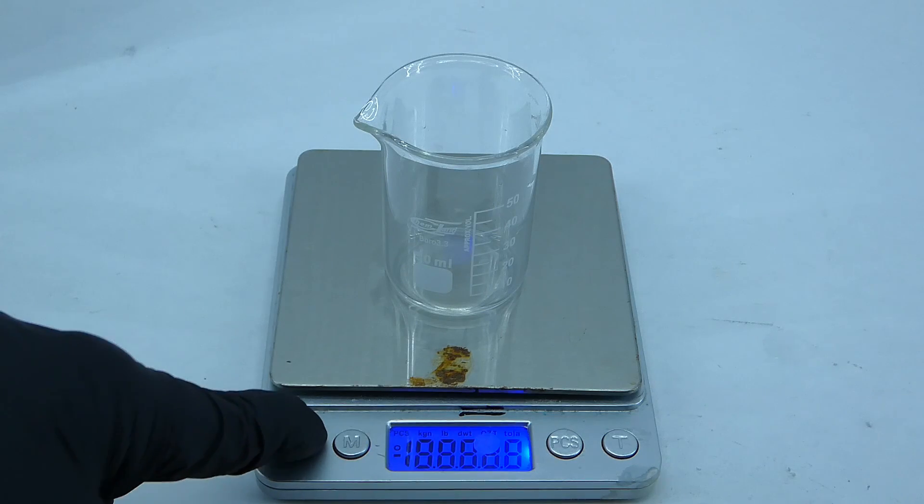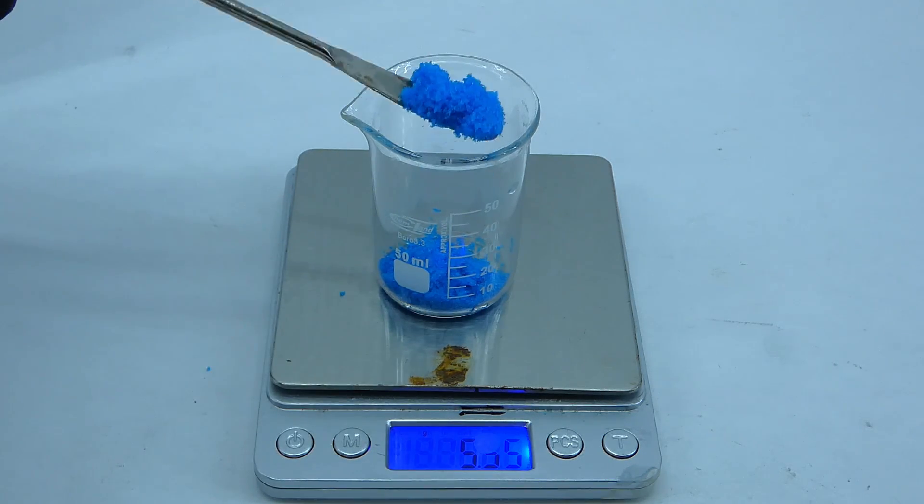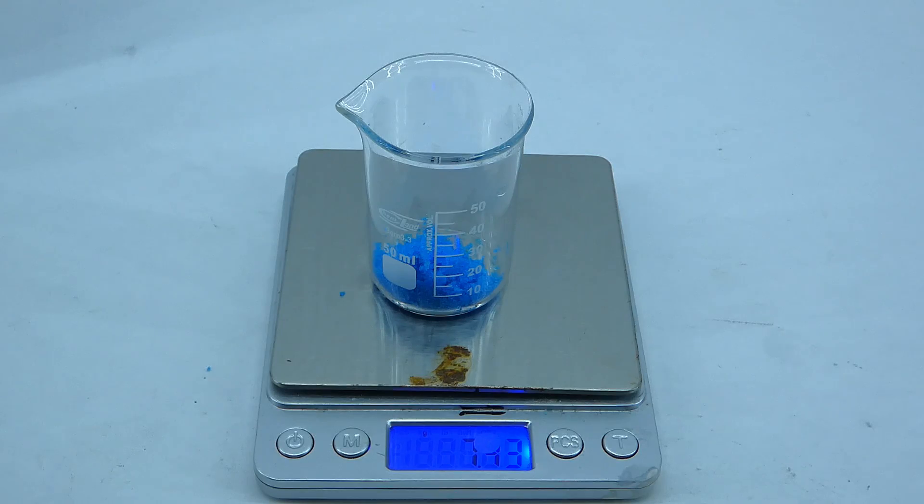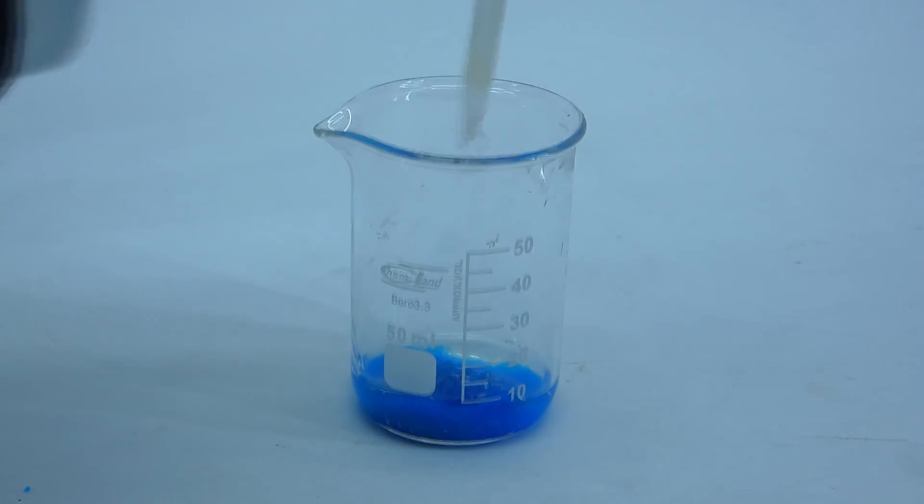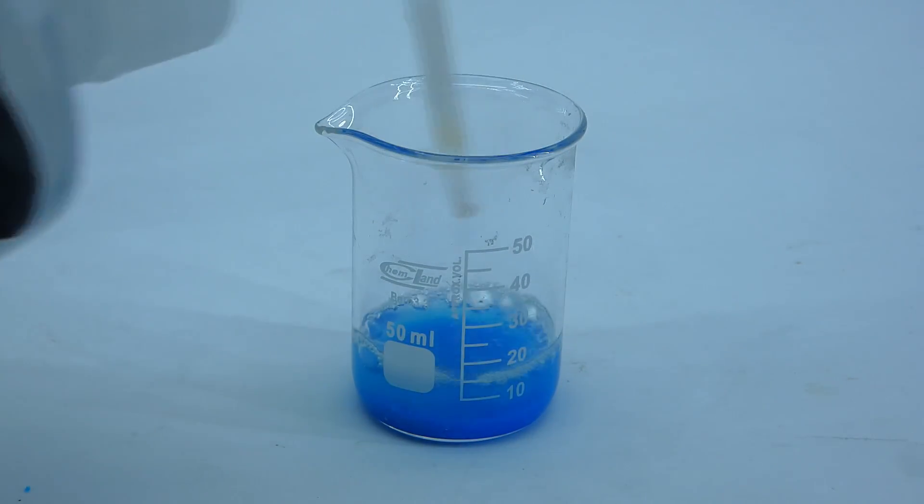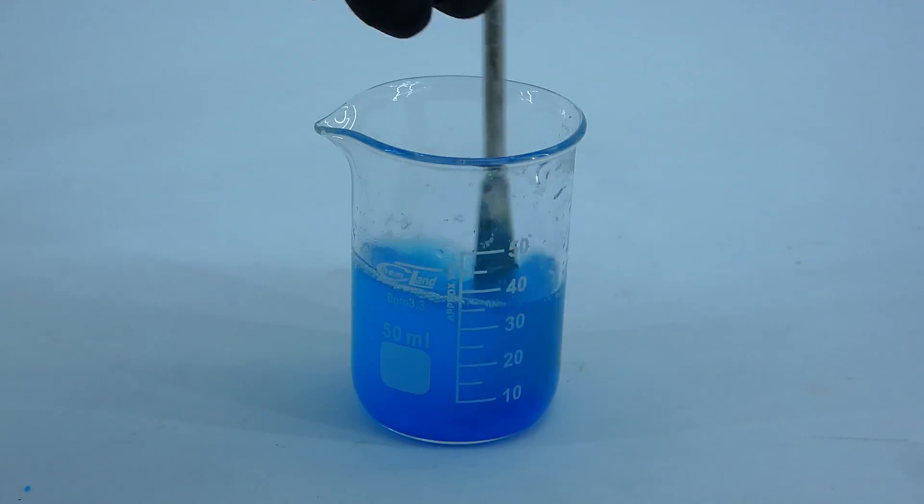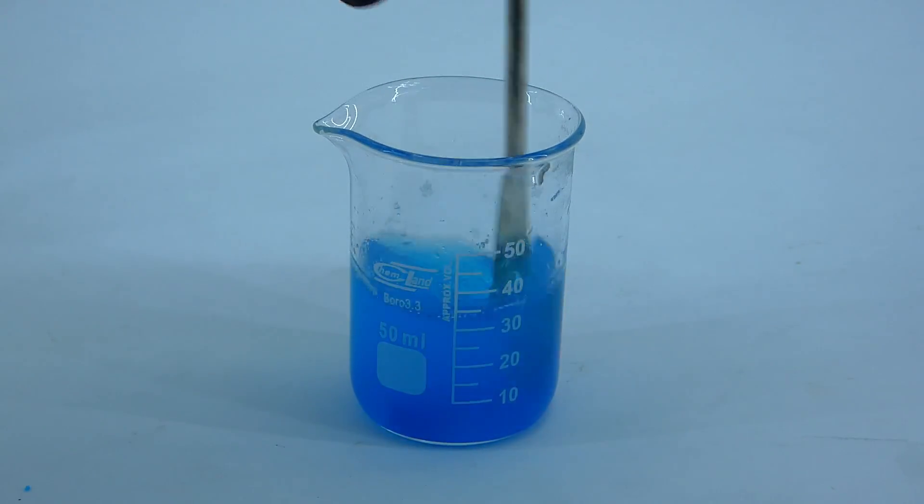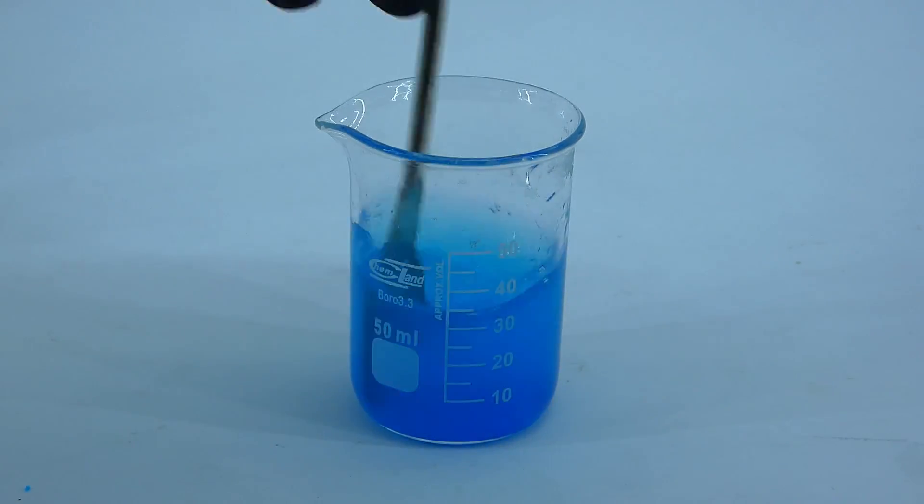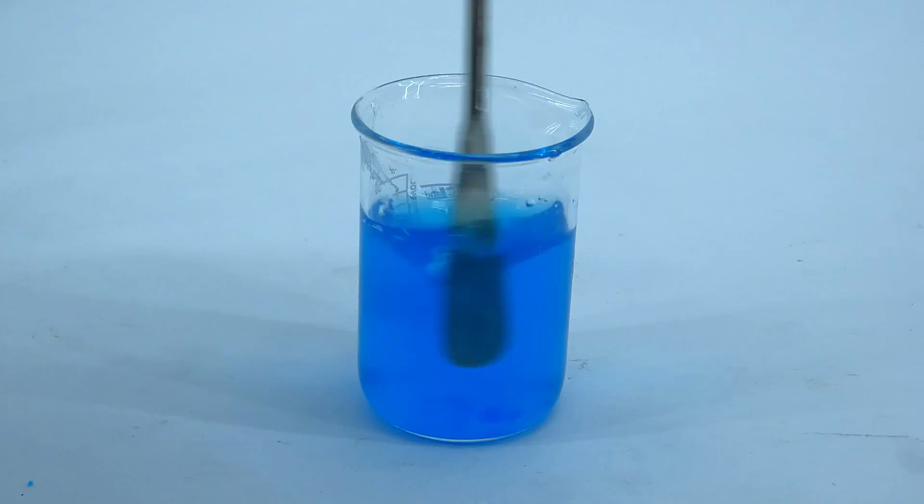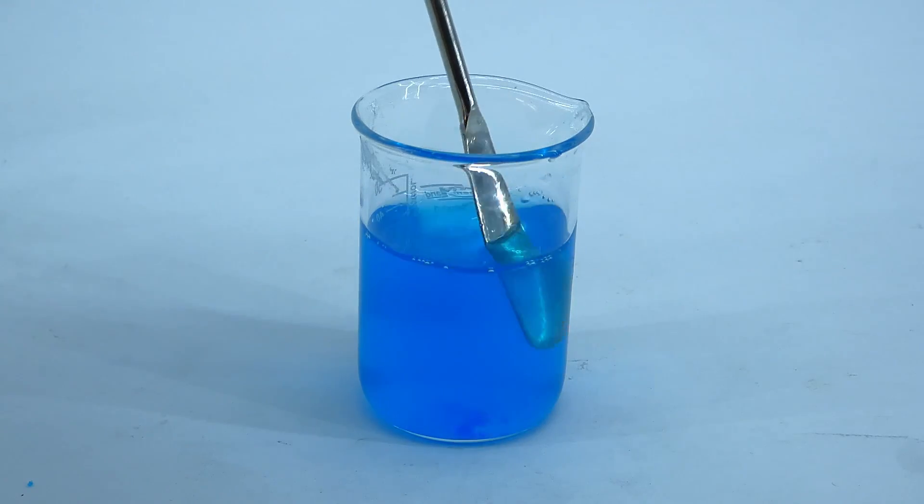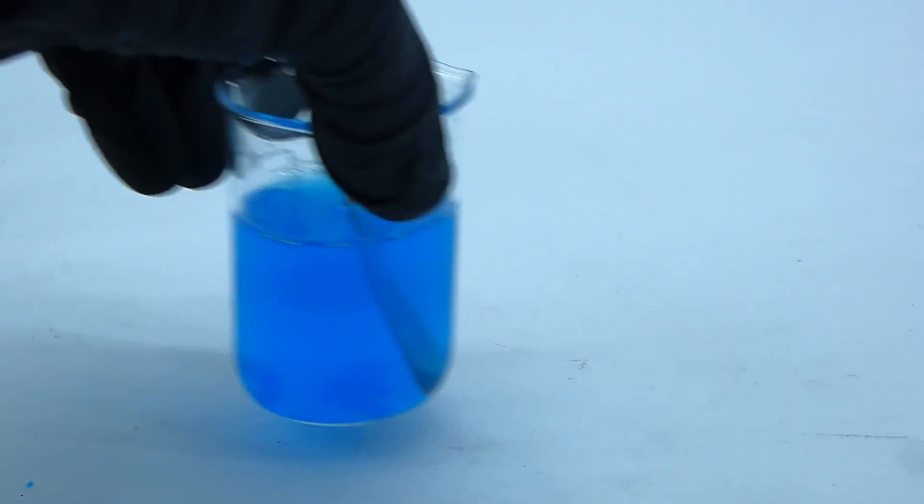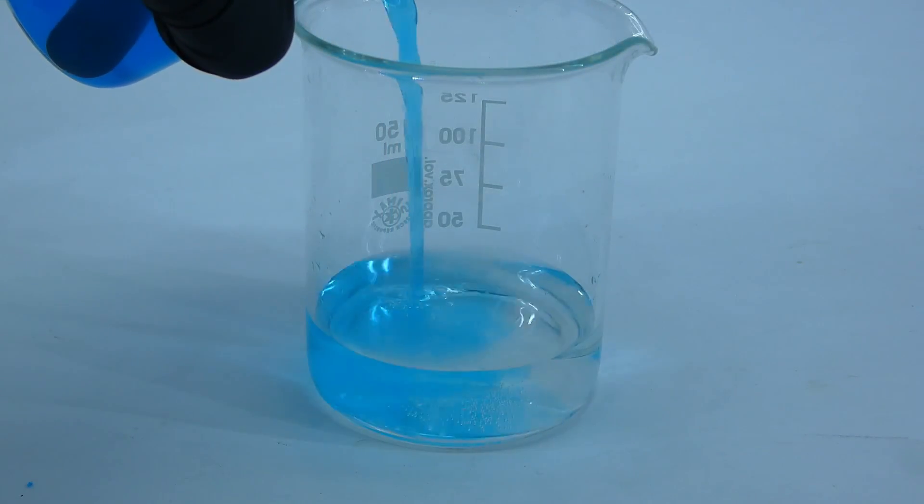I weighed out 7.2 grams of copper sulfate pentahydrate in a small beaker, and added about 30 ml of distilled water to dissolve it, which turned out to be harder than expected, but after 10 minutes of manually stirring this thing, I managed to finally dissolve most of the crystals, and now it was time to combine the solutions.